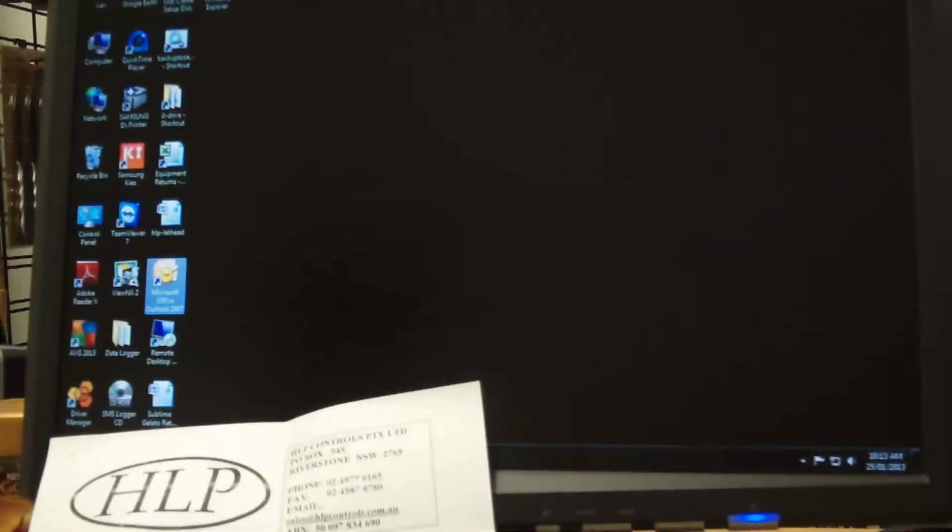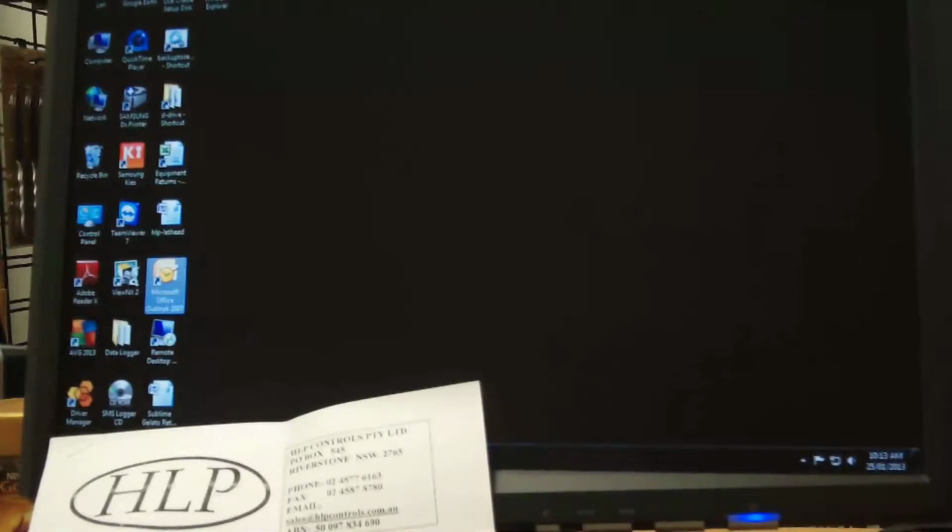That's not too bad. The software comes on a disk. Now I'll put the disk into the computer. Put the disk in the computer, close the door of the disk drive. Now, the computer, depending on how it's set up, will recognise that we've put a disk in, and it should come up with something on the screen. So just give it a minute to see if it brings up the menu.